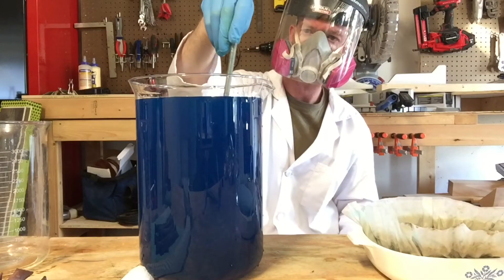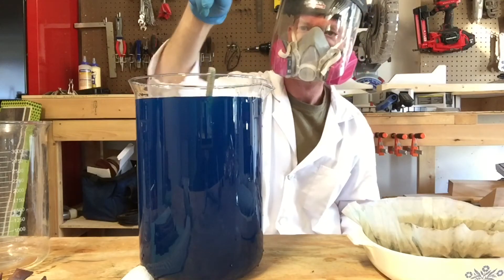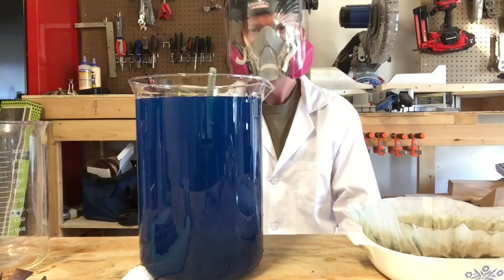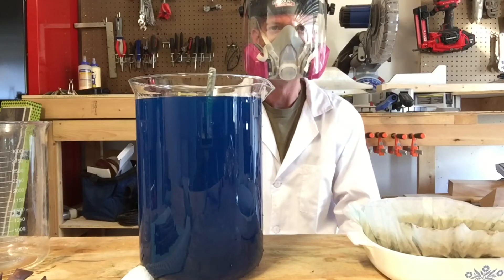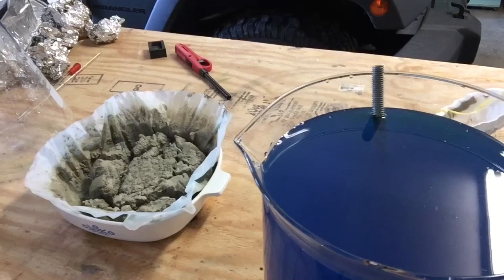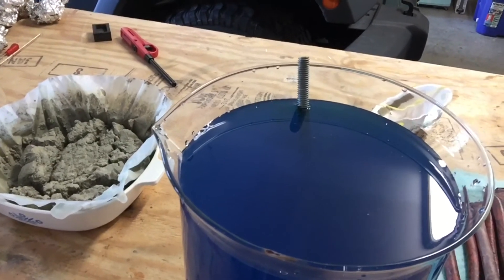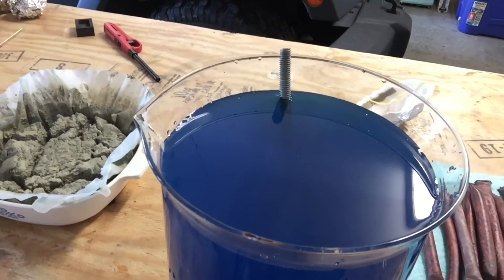The liquid is getting really full right now so I'm going to have to be very careful. I'm just going to ease it down in there, just like the copper. This should start to react after a little while. As you can see the steel is already starting to react and the copper should start to cement out. I'll show you how it looks again tomorrow.